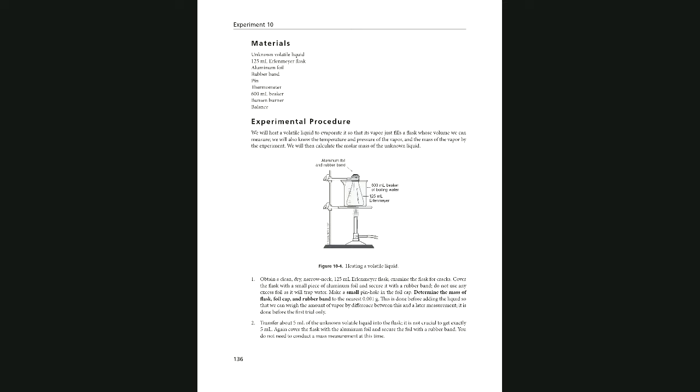So by watching the video, you are going to record the values for data. You collect your data so you can complete your data sheet and finish the calculation and turn it in to your professor as an assignment. So we're going to start with the procedure for the experiment.